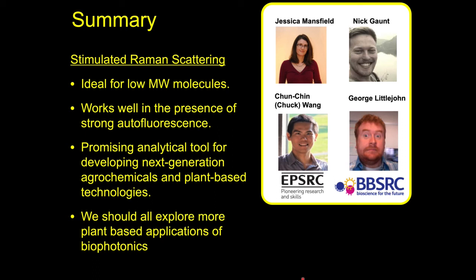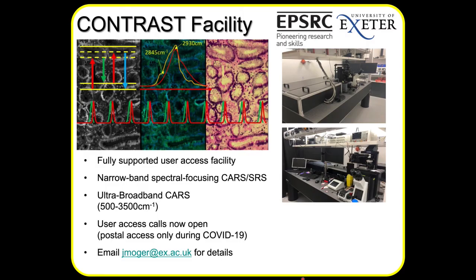And I hope that you found this interesting, and I've encouraged you all to explore plant-based applications of your biophotonics techniques. If anyone's interested in finding out a little bit more about stimulated Raman scattering or CARS microscopy, we've recently been awarded the UK's first coherent Raman user facility called Contrast at University of Exeter. It's a fully supported user access facility, and we have both a CARS and stimulated Raman microscope, and also an ultra broadband CARS system that I haven't talked about in this presentation.